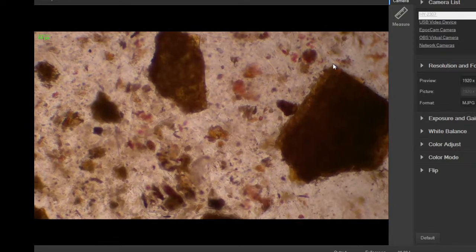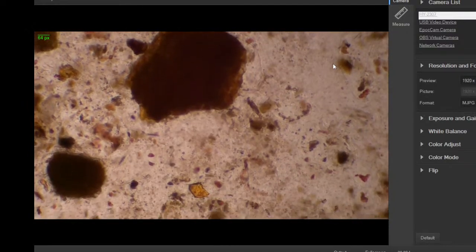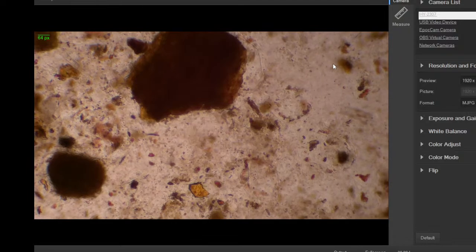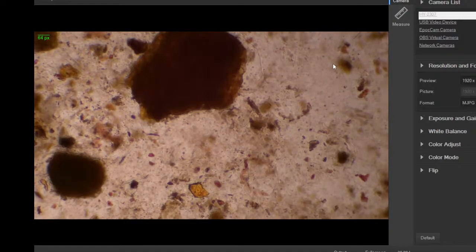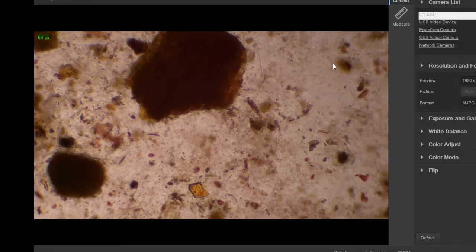Lots of little things flowing around, different colors, different structures, particle sizes. After a while, this would settle out. You would have all these particles dancing around. So that's enchilada sauce.